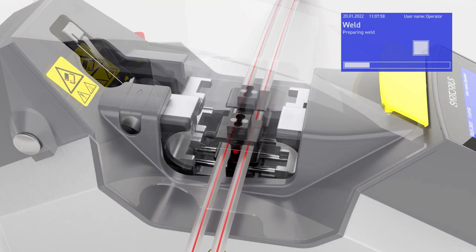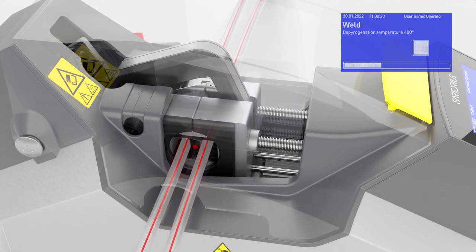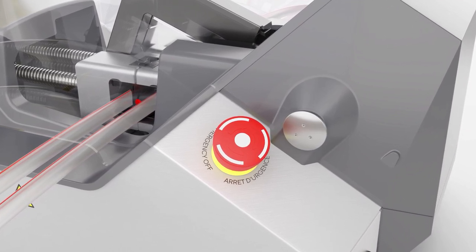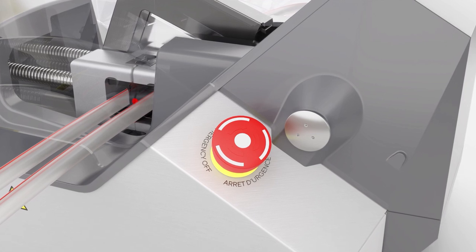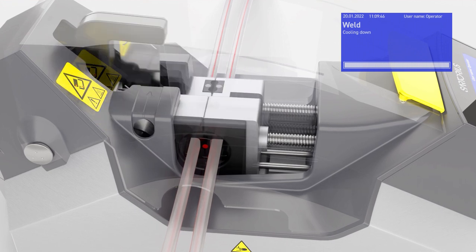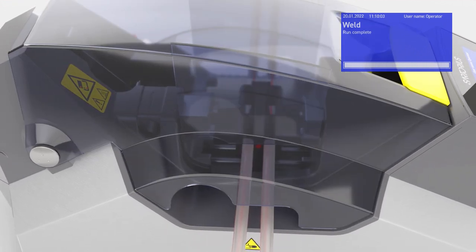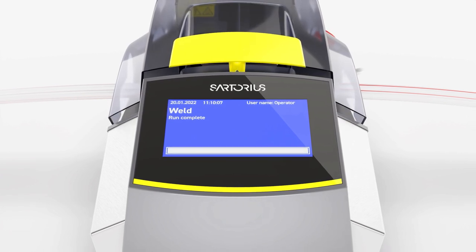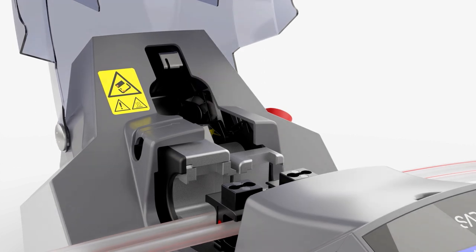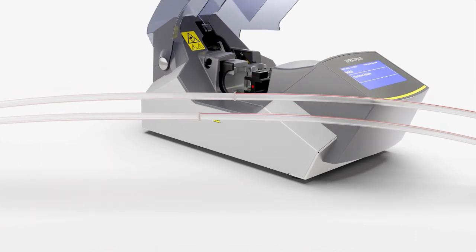The process will run fully automated and the lid will open when finished. In case of an emergency, the process can be interrupted at any time by pressing the emergency stop switch. Once this step is finished, remove the blade and the tubing. Your welding process is now completed.